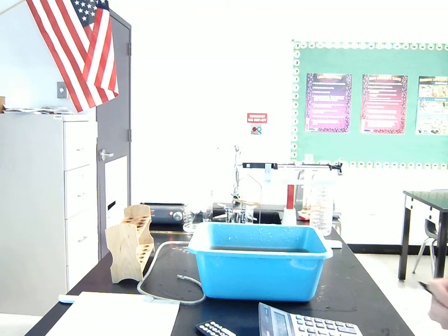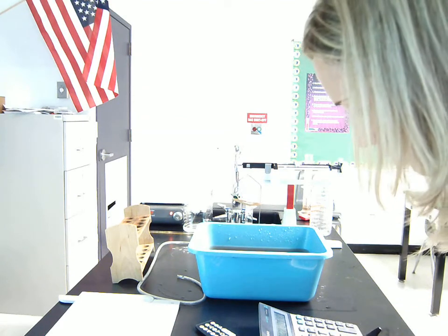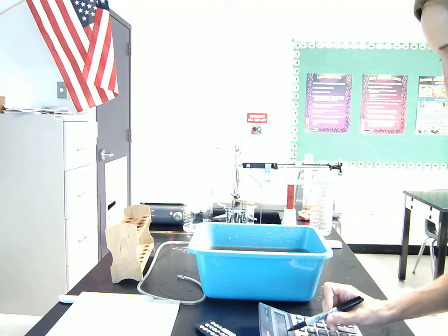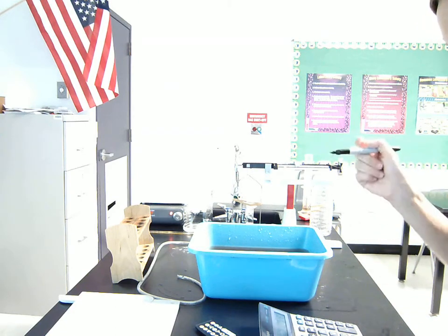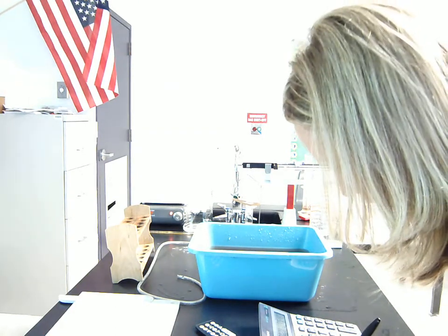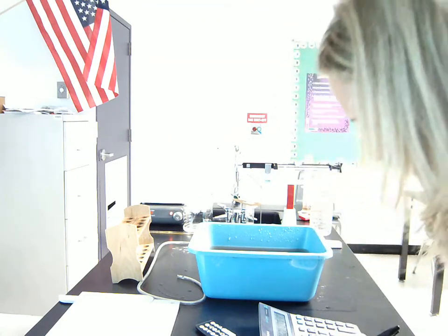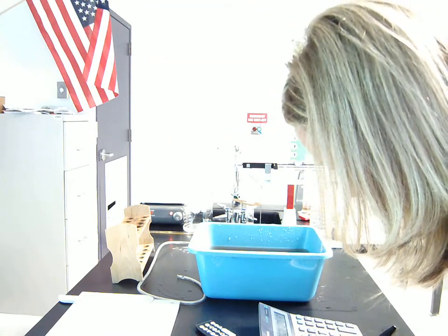Oh, wow, not too bad. I did pretty good. All right, so in terms of using significant digits, I should have 3, so 0.00202. And that's going to be grams per cubic centimeter.